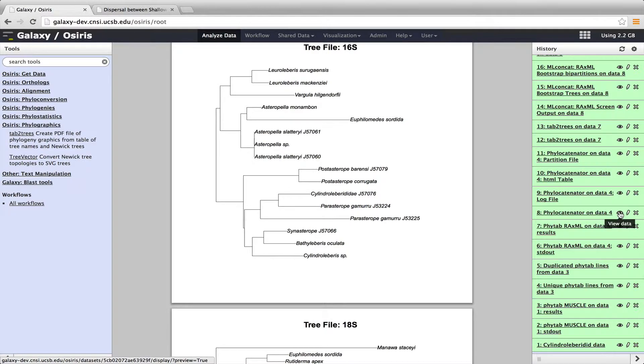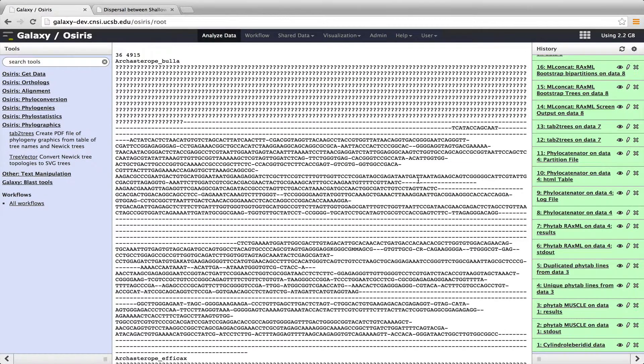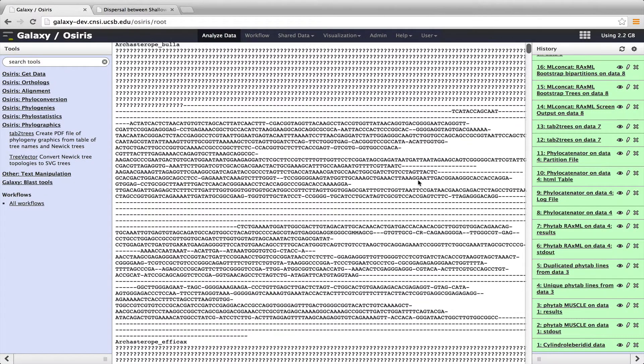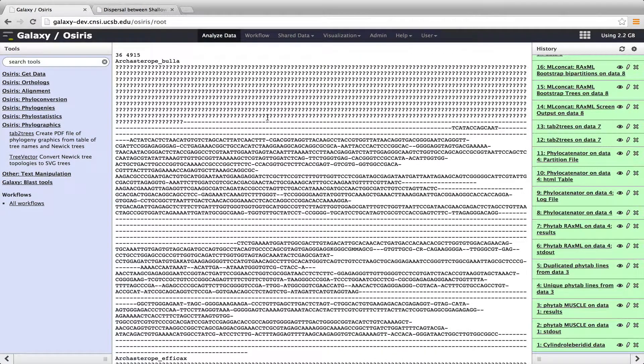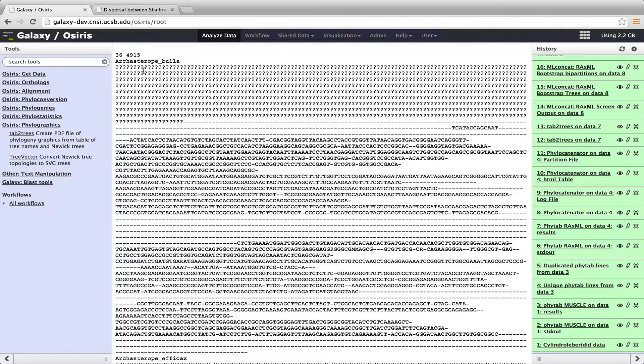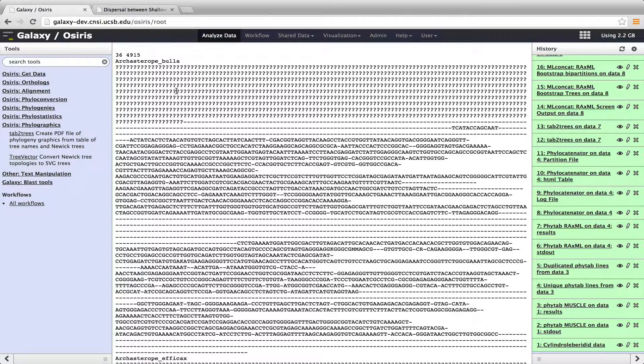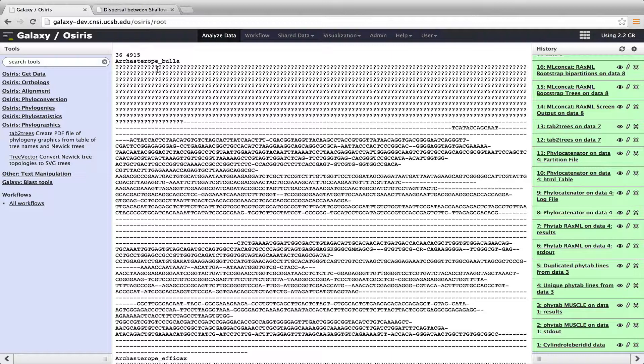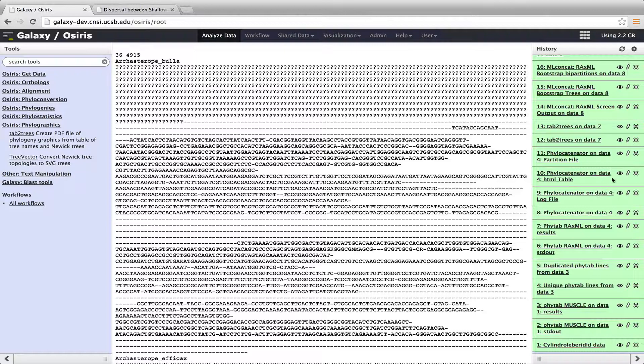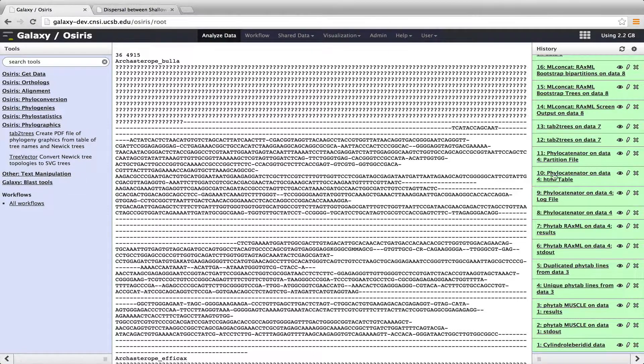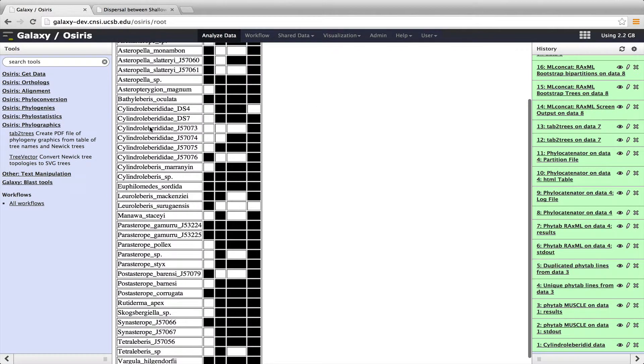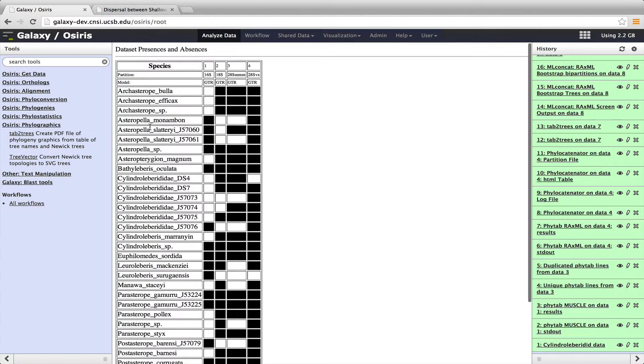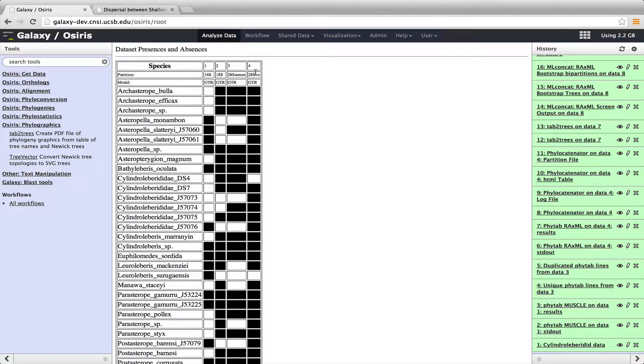And then in addition, we ran through the data through phylocatenator. And that is a tool that concatenates the different genes into a single file. And it fills in the missing data with question marks, as you can see here. So Archasterope bulla, this species, is missing the first gene. And so it fills that in with question marks. So it allows it to have a single RAxML file here. So we have 36 different species, 4,915 different characters. Now, one thing that phylocatenator also does, if we click on the eye of this HTML table, it produces a summary of the species that we have in our data set and the genes that we have in our data set.